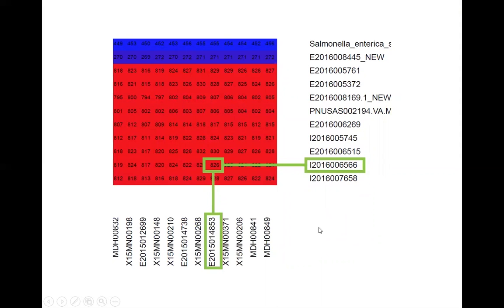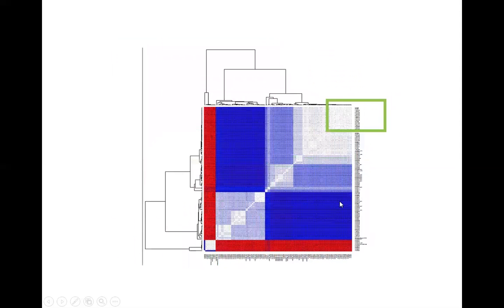So it's a slightly more complex way to communicate, rather than saying here are two isolates that are the same, but it allows epidemiologists and end users to look at these data and identify the SNPs between any pair of isolates that one is interested in.